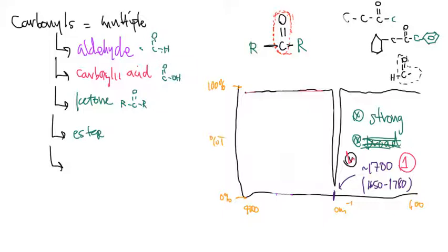This one, if I put a carbon here to the right, it's not a ketone. And the reason is because there's a hydrogen on the other side. So this would not be labeled as a ketone unless I change this hydrogen up and I replace that with maybe another carbon or another ring group or some kind of alkyl group that sits on that side. So that is a ketone. It's a carbonyl in the middle of the molecule.